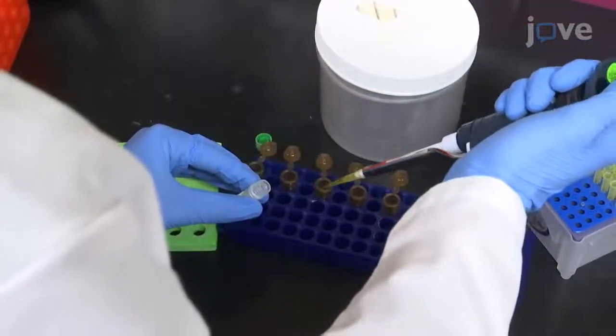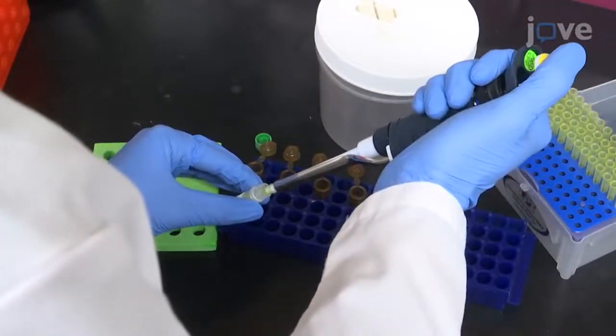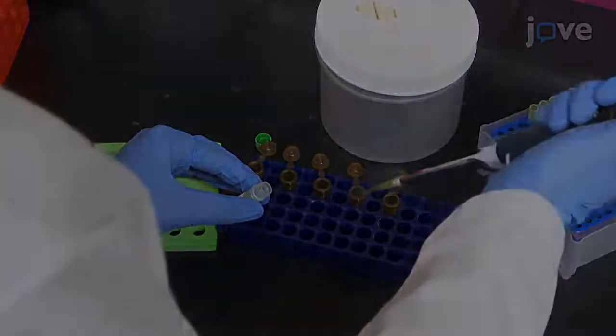Dispense 100 microliter aliquots of the peptide into light dampening or resistant tubes to protect the peptide from bleaching.